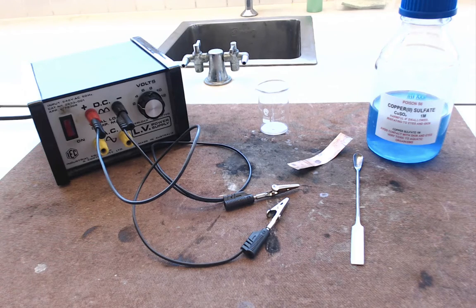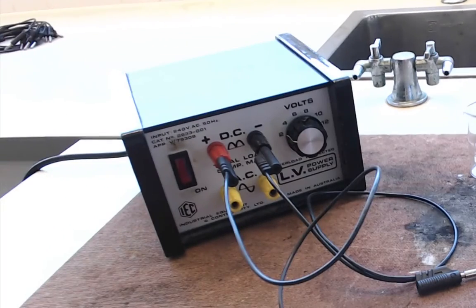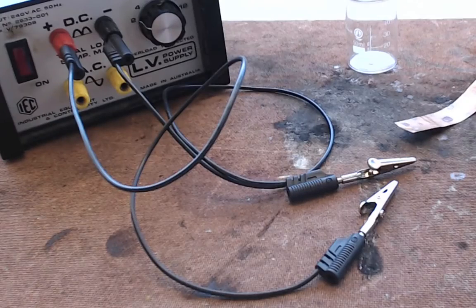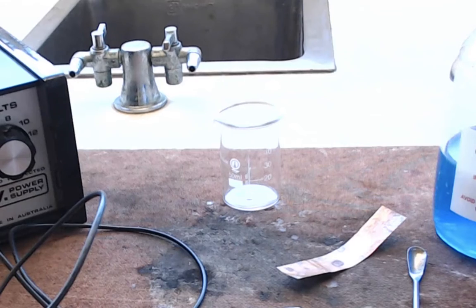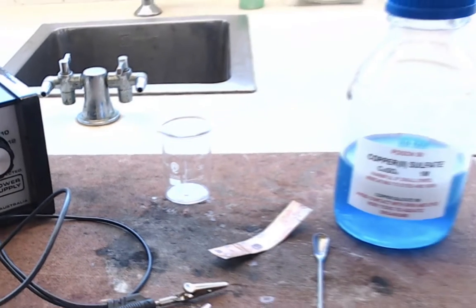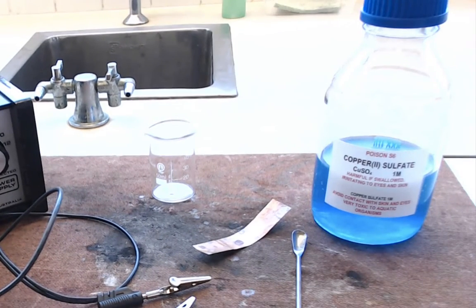Here's the equipment that you need. You've got a power pack, a couple of leads, a couple of crocodile clips on the end of the leads there, a small beaker about 50 millilitres, some copper sulphate. The concentration here is not that important.